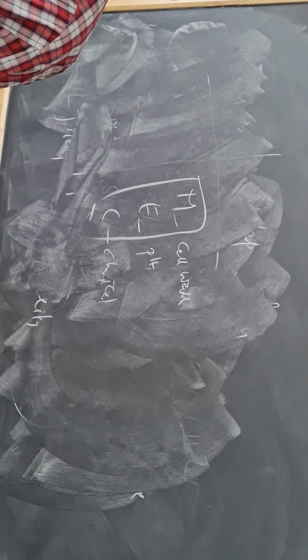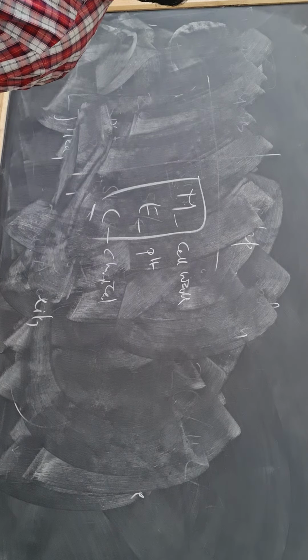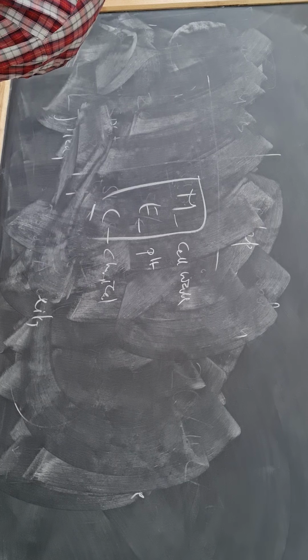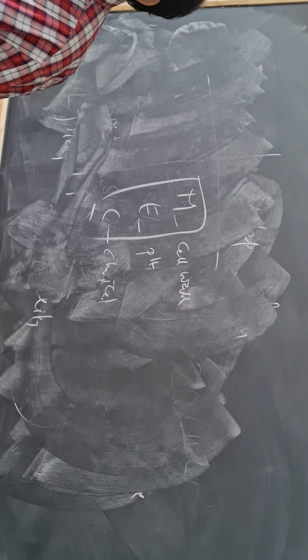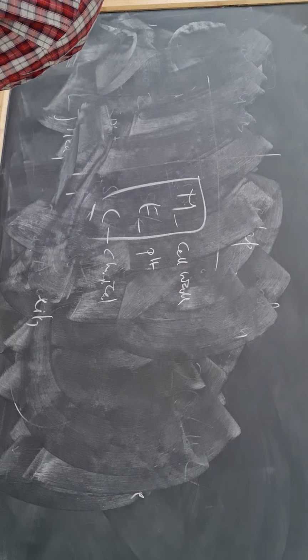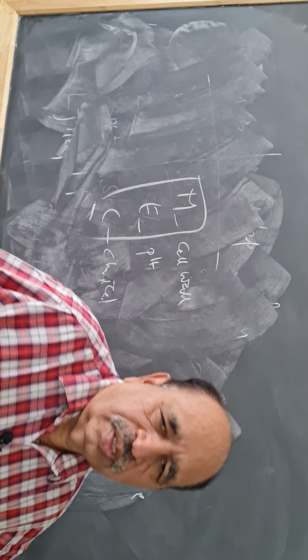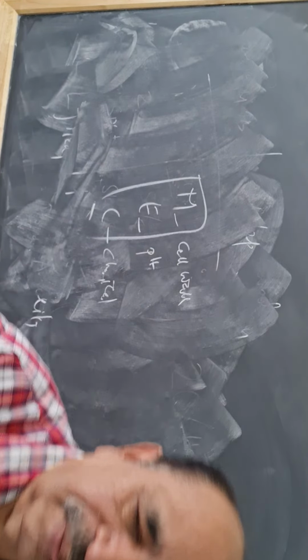Salmonella, Shigella, Proteus, Pseudomonas, E. coli, Klebsiella, Spirochetes and Coccobacilli are all gram negative. Bordetella, Brucella, Haemophilus, Yersinia are all gram negative. Now move to the practical hall where we are going to do the Ziehl-Neelsen staining. Everybody will do the Ziehl-Neelsen staining. Okay, thank you.